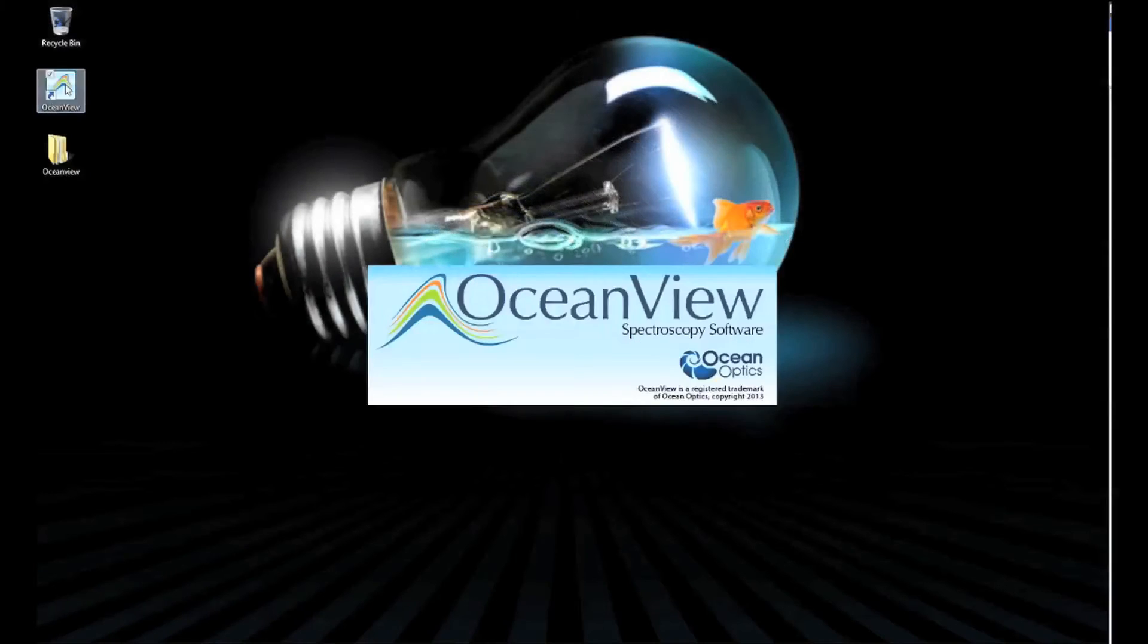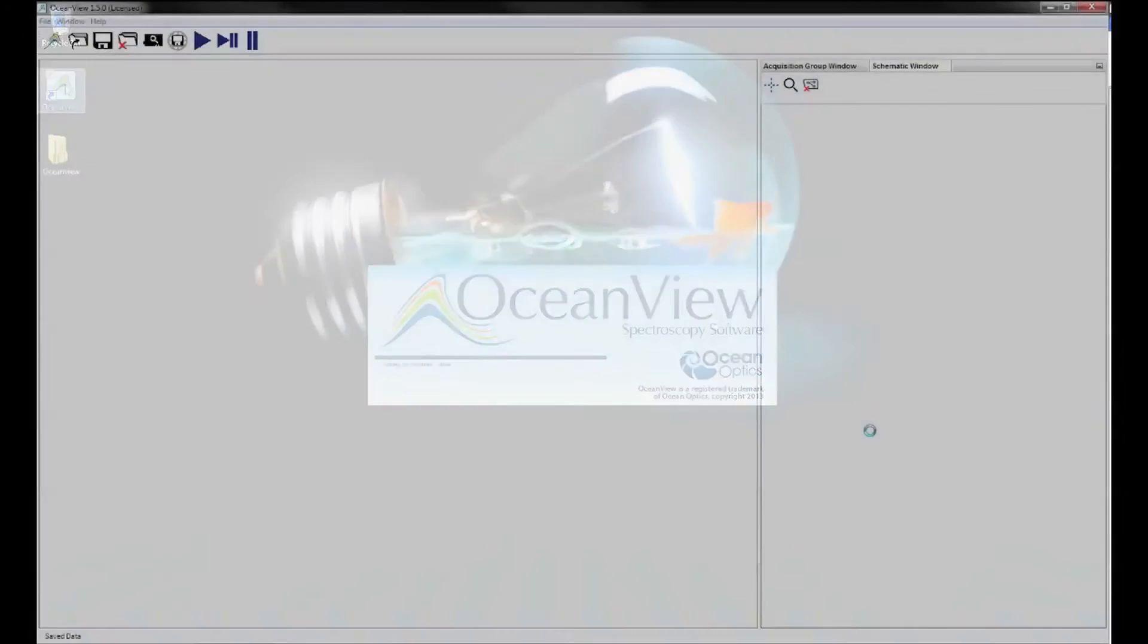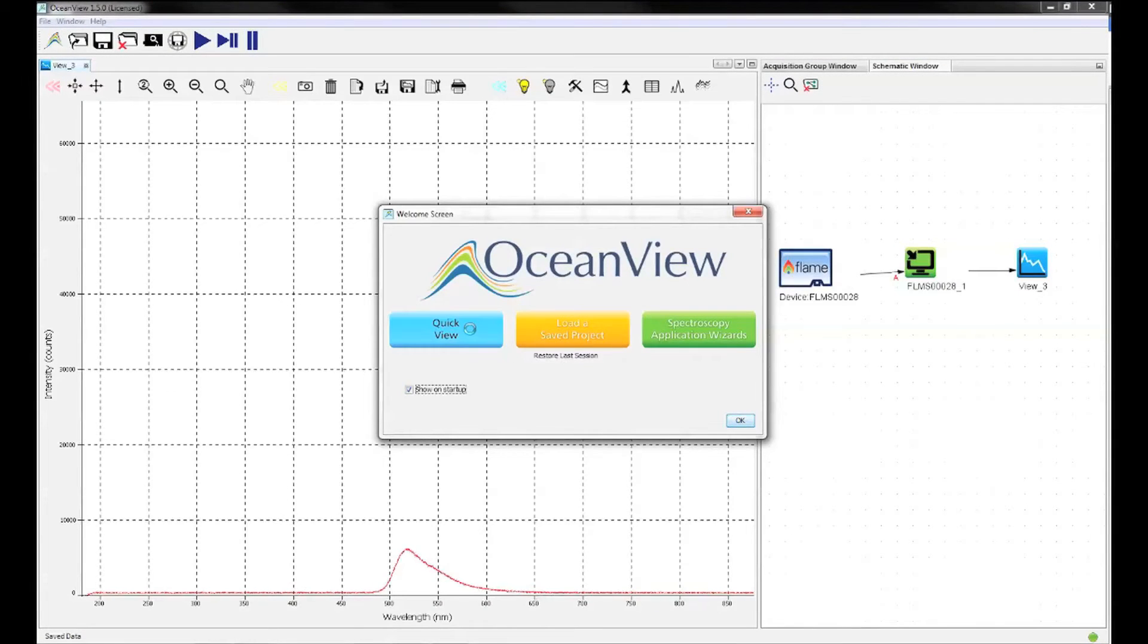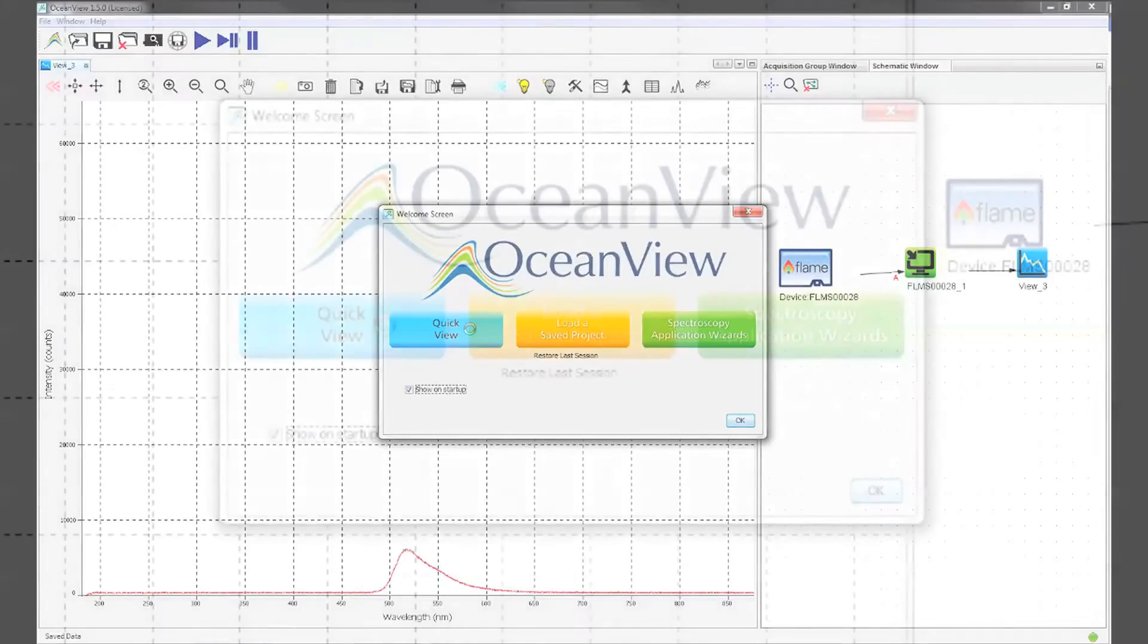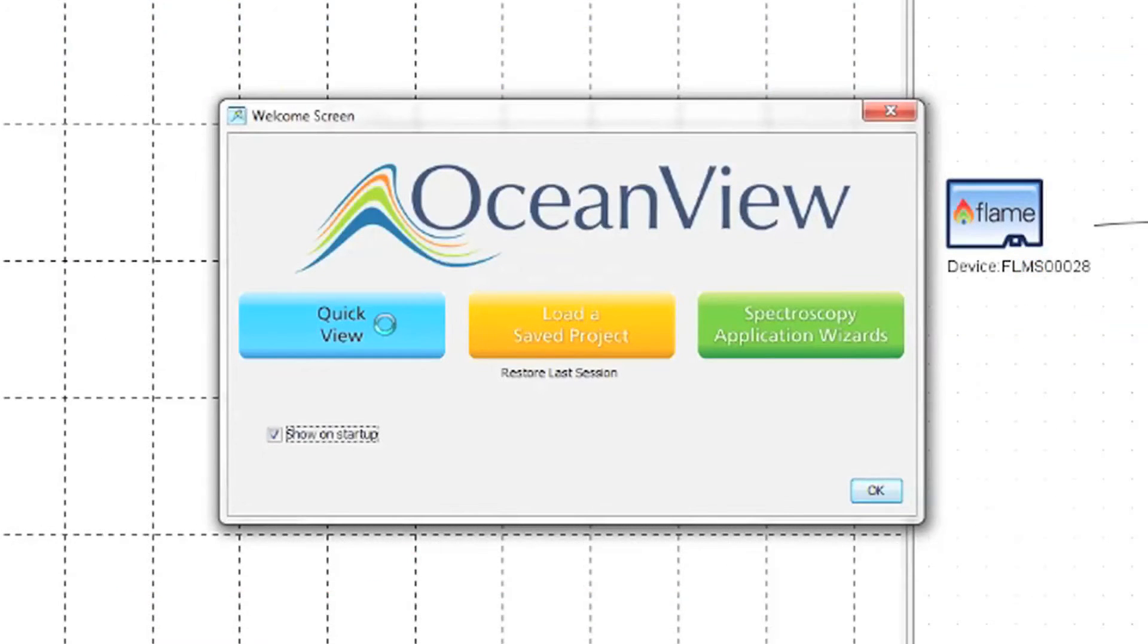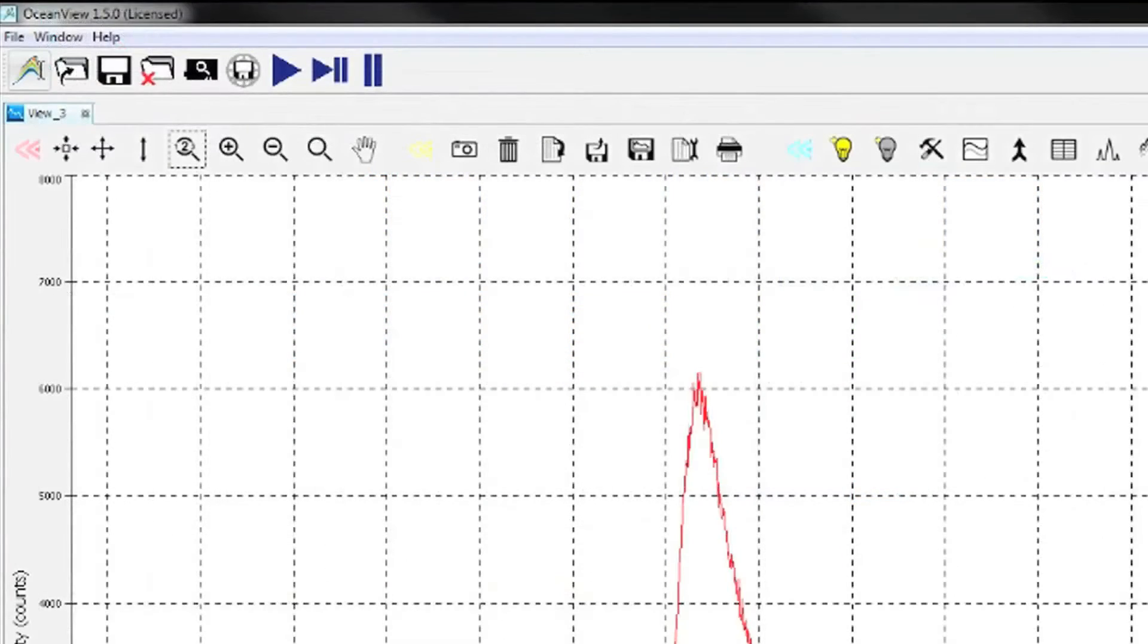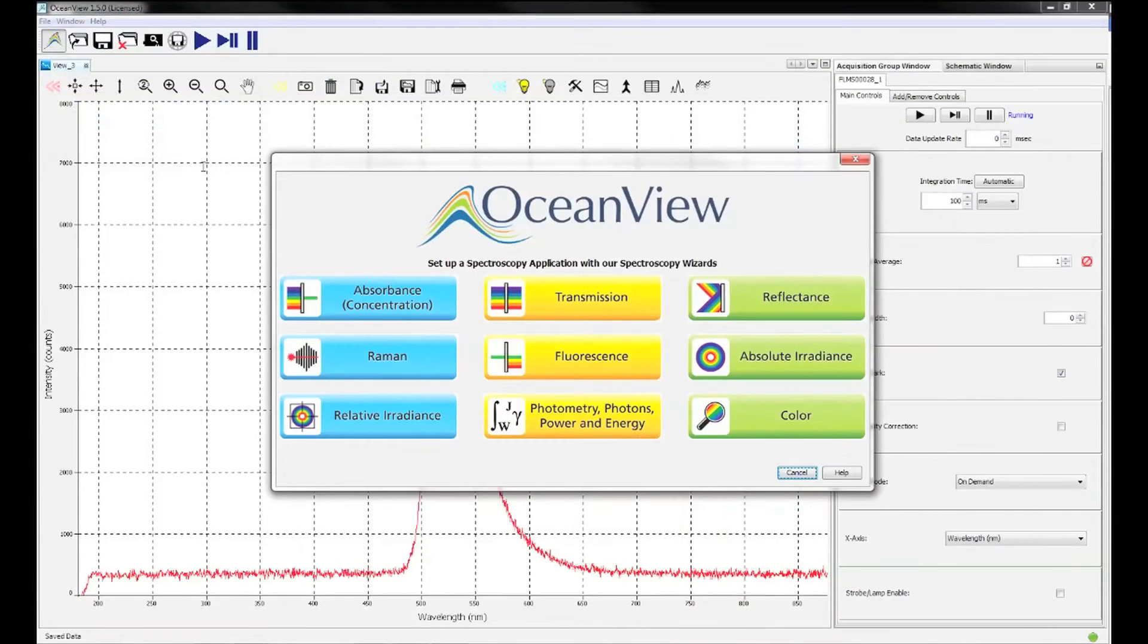Now that you have set up your experiment, open up the Ocean View software. You will see the raw spectrum of light being received by your spectrometer. Select the spectroscopy application wizard from the pop-up window, or create new spectroscopy application which can be found in the top left corner. Then choose fluorescence from the menu.